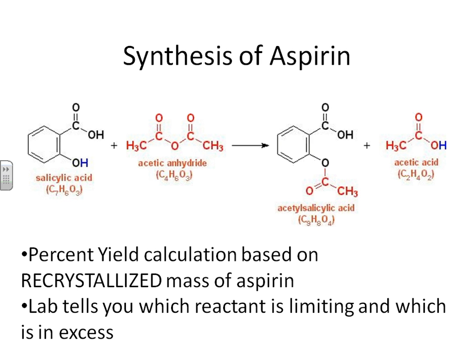Now, there are two reactants, the salicylic acid and the acetic anhydride, so you're going to have to figure out your theoretical yield. The lab handout tells you which one, the salicylic acid or the acetic anhydride, is in excess. Therefore, the one that is not in excess is the one that's limiting. I'm not going to tell you that. You need to go back and look at that. Once you figure out which one is in excess, the other one will be limiting.